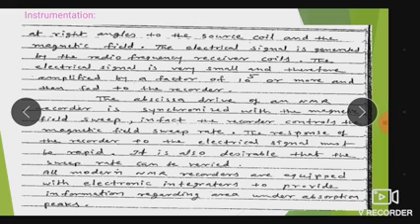Thus, the electrical signal is generated by the radio frequency receiver coils. The electrical signal is very small and therefore amplified by a factor of 10 to the power 5 or more, and then fed to the recorder.